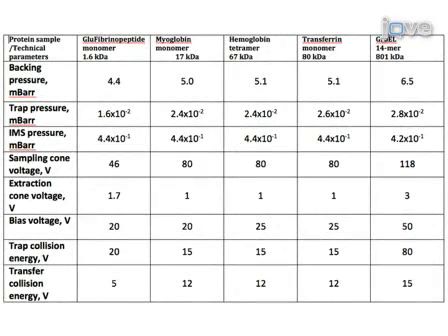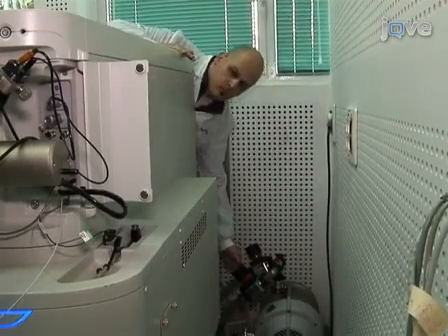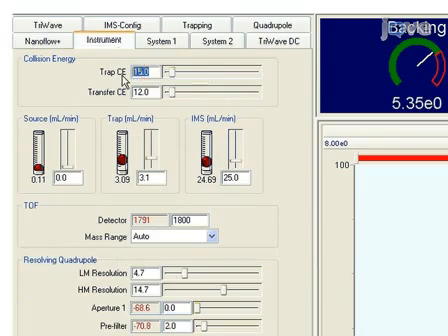Although these parameters are sample dependent, shown here are the conditions used for acquiring MS spectra of various ion masses, from peptide to protein complexes. Large ions require higher collision energies and bias voltage. It is also recommended to increase the back pressure for the analysis of large protein complexes. To minimize the activation of the complex, try to gradually reduce, in steps of about 10 volts, the sample cone, extraction cone, trap and bias voltages without changing the position of the peak.